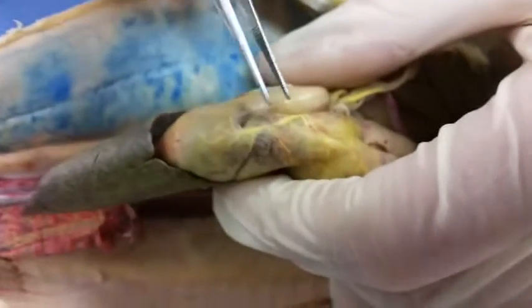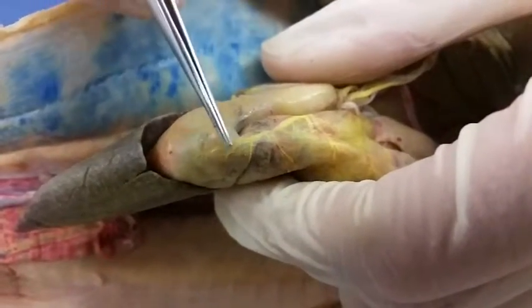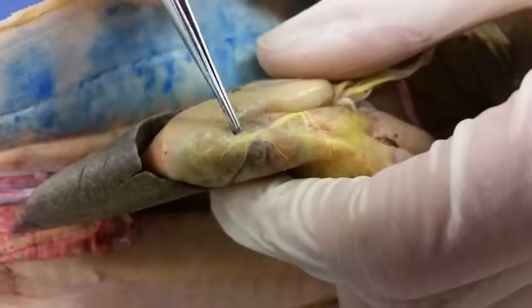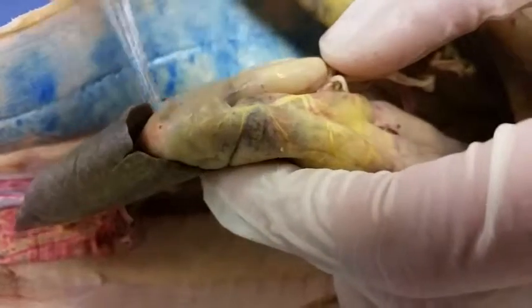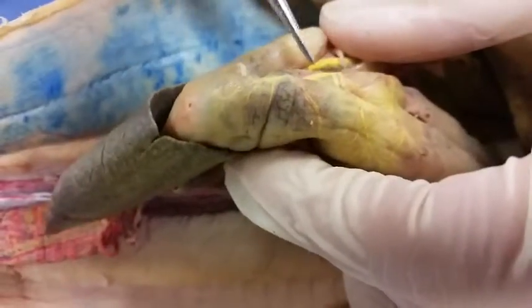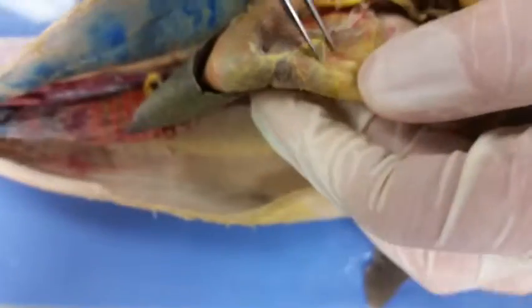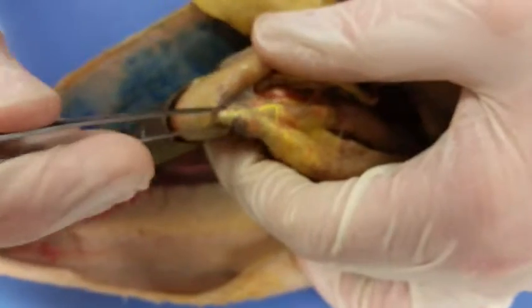And then we have around over here, you can see the duodenal artery running right next to this yellow. There's a faint line of pink duodenal artery feeding into the duodenum right here. There are pyloric veins and sphincters, which are also in this area, right around the pyloric sphincter, which is here.